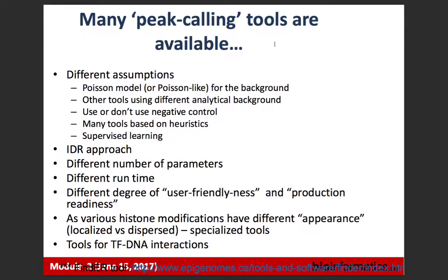Because the major problem of enrichment calling, given those principles, is that we don't know the background. We don't know what to expect. That's why I think this type of experiment is even more complicated than any other kind of experiments like RNA-seq, etc. Because we absolutely don't know. And we are at the mercy of quality of antibody, many, many things. So what is the noise?